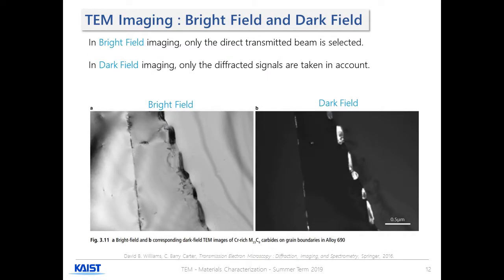We will conclude this qualitative discussion on TEM imaging by talking about bright and dark field images. We have seen several physical mechanisms contributing to the contrast of our images. But we can also mechanically affect the transmitted beam in order to modify the final image. While the details will be discussed in the instrumentation section, we can already define bright field images as obtained by selecting only the direct beam, while dark field images are obtained by selecting diffracted beams.